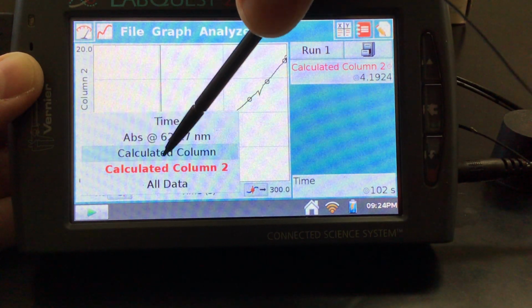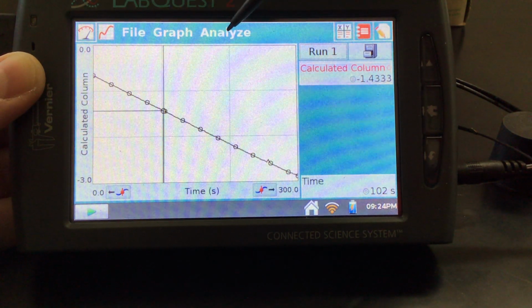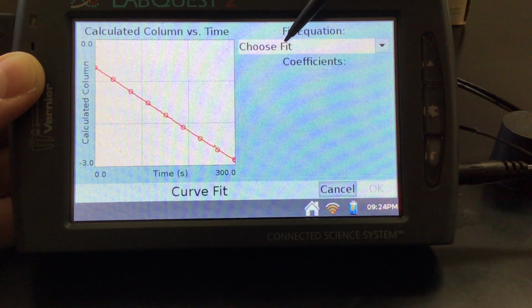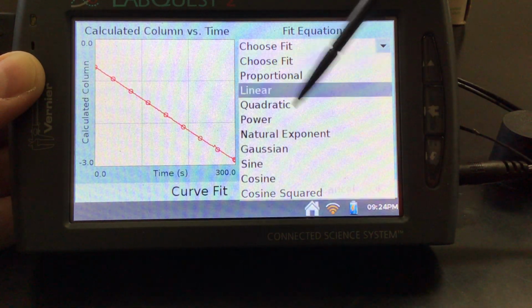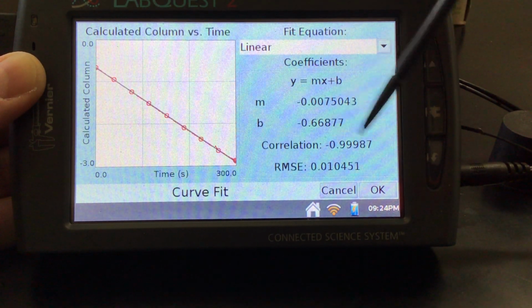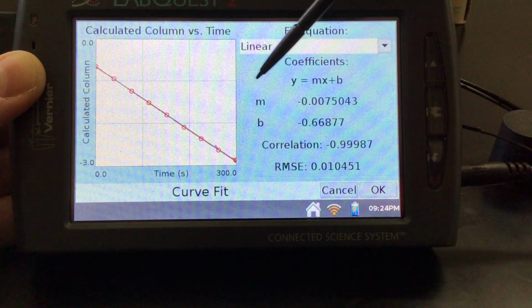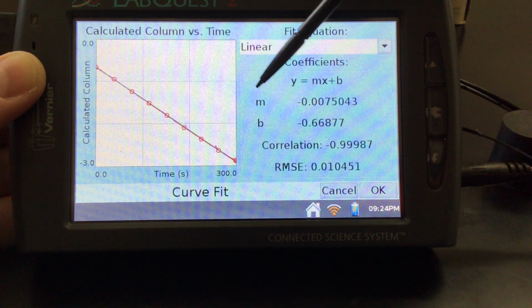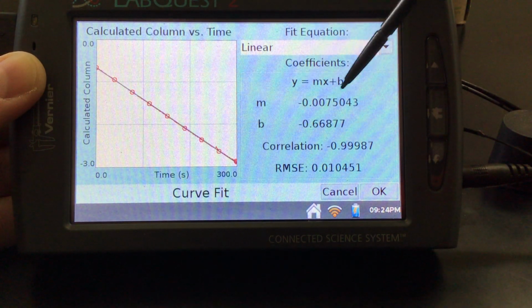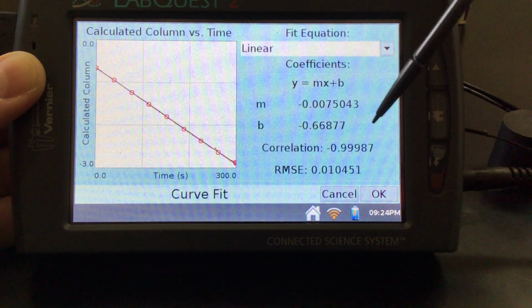So I'm going to switch over here to our first calculated column, and we can see it's very linear. In fact, what we can do then is analyze this, do a curve fit of our calculated column. We're going to choose a linear relationship, and we can see our correlation is really, really close to 1. That tells me that my data points really match the line really well. And then think about what this slope means. If we think about our integrated rate law, this slope is going to tell us our rate constant. Very powerful piece of equipment this whole LabQuest is.